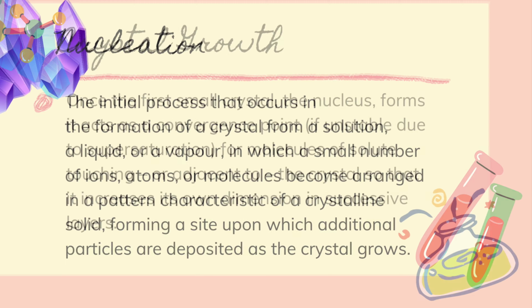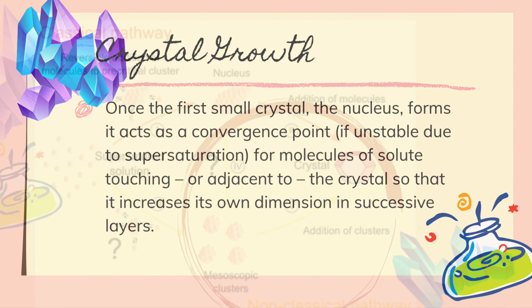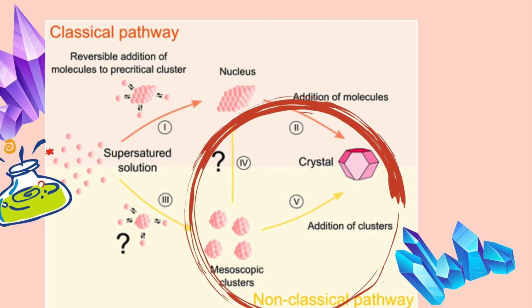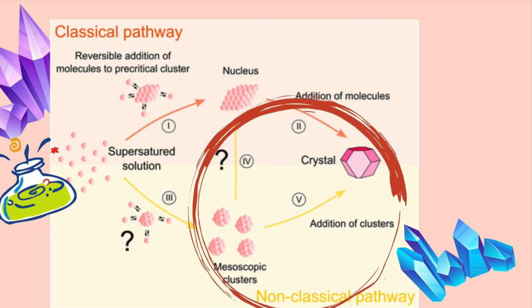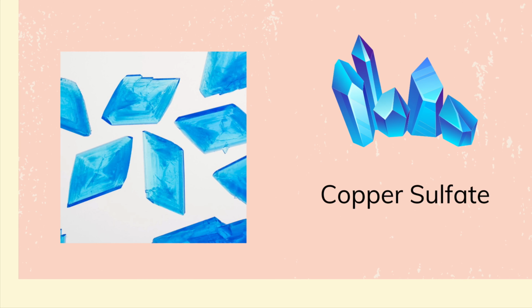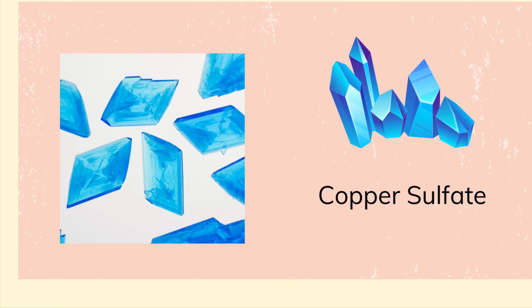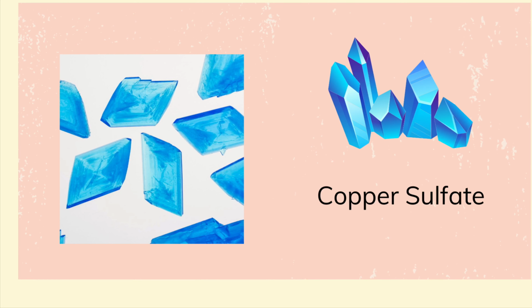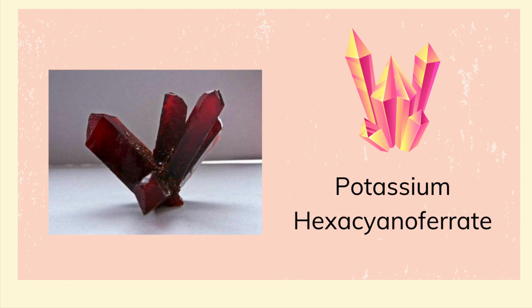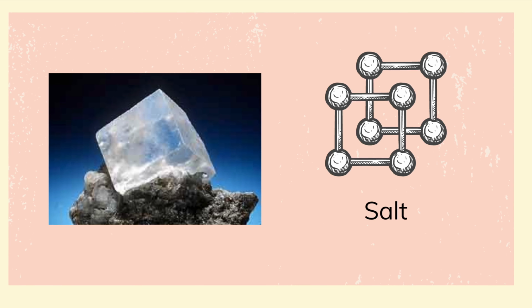The second step is crystal growth, which is an increase in the size of the crystal. However, there is also a non-classical pathway in which crystals start to form from little clusters and merge into larger crystals. The structure of a crystal depends on the geometric arrangement of molecules inside the crystal. Like what we saw in this experiment, copper sulfate forms a blue rhombus-shaped crystal, and potassium hexacyanoferrate forms dark red rectangle-shaped crystals. Another well-known crystal is salt, which we eat.